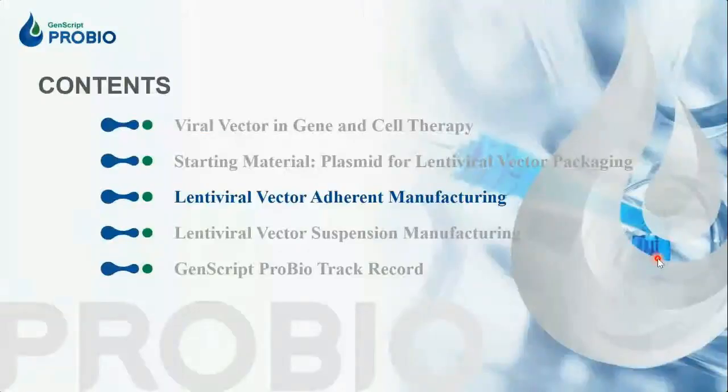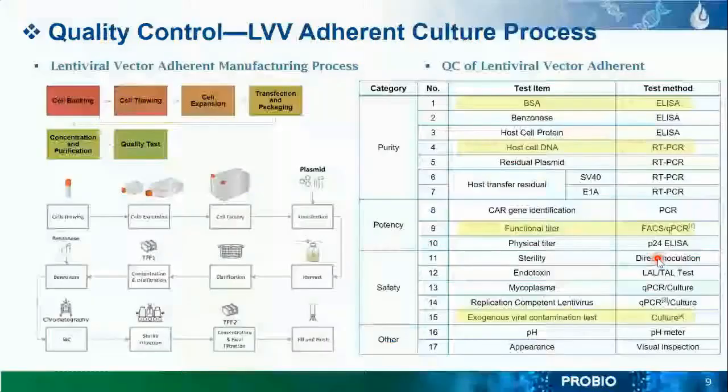Now I'd like to talk a little bit about adherent manufacturing and give you a short introduction.